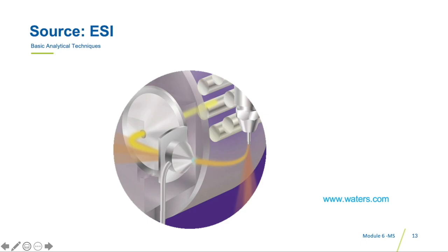This schematic from the Waters Corporation shows the position and the actual shape of the different parts of the ESI source. The capillary tube is seen on the right, where an orange stream of sample is sprayed and forms the usual cone seen from a spray nozzle.